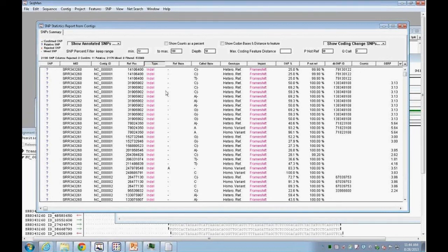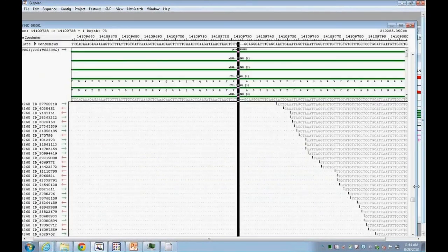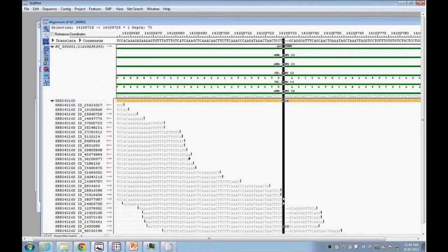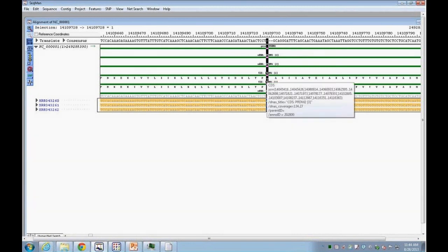And so this top one actually sorts out pretty well. If we look at this top series of indels, we have an insertion of 3 bases here. So if we double click and look, I'm just going to collapse this down here. So the real small indels, again, depending on the read length that you have.